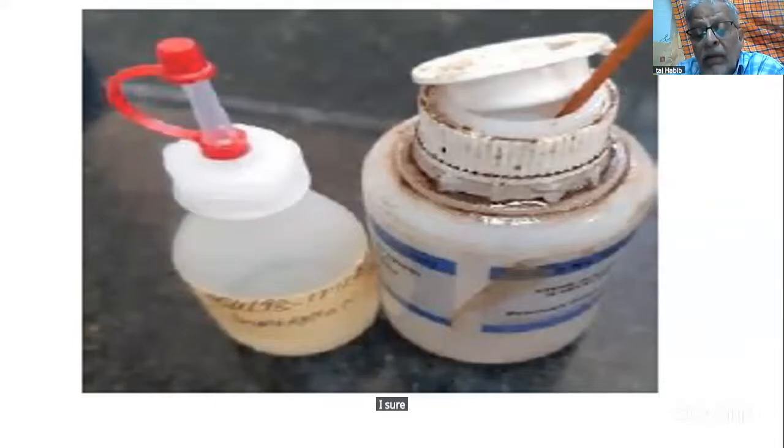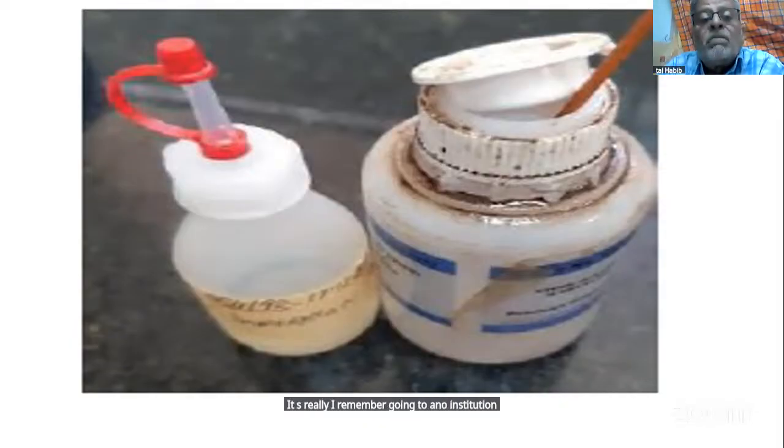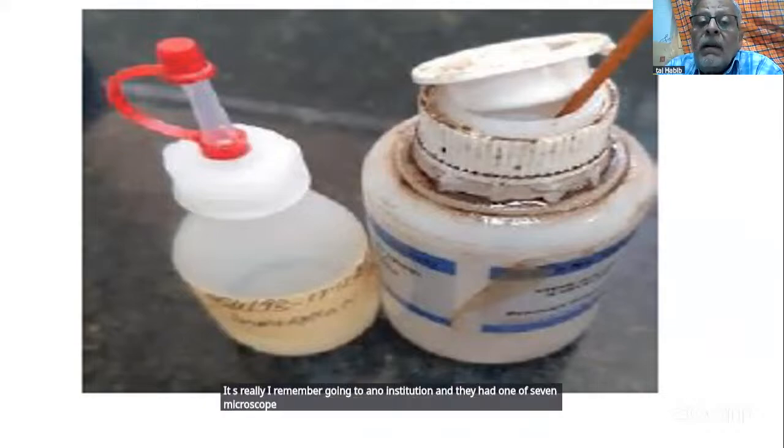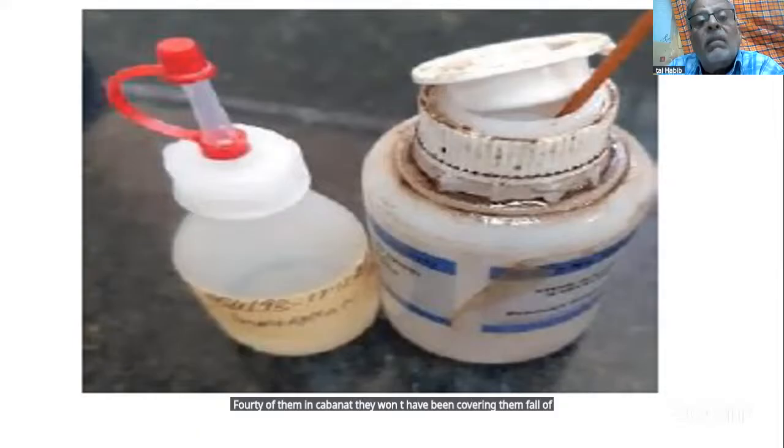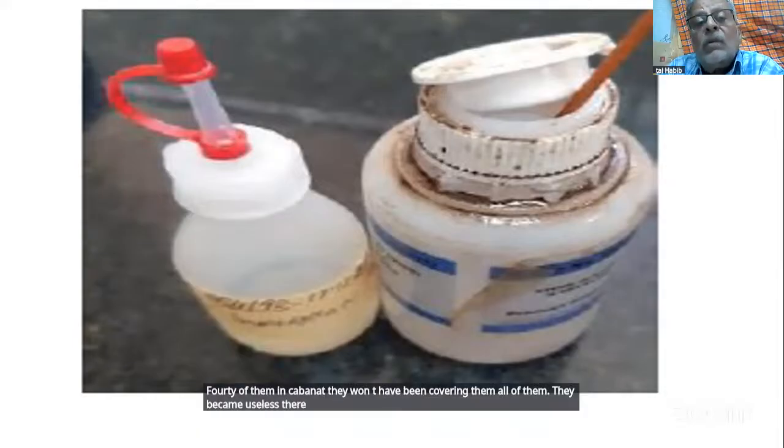I remember going to an institution in Mombasa, and there were 40 microscopes in a cupboard. They were not covering them. All of them became useless. They had to be thrown.